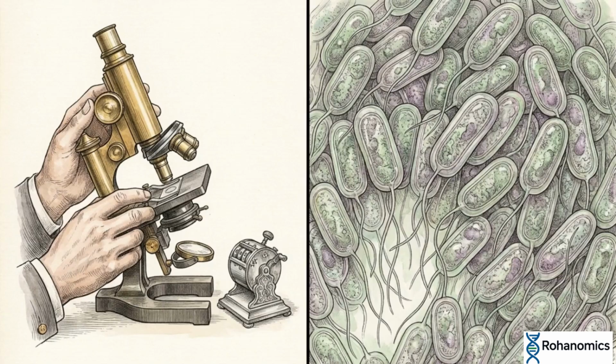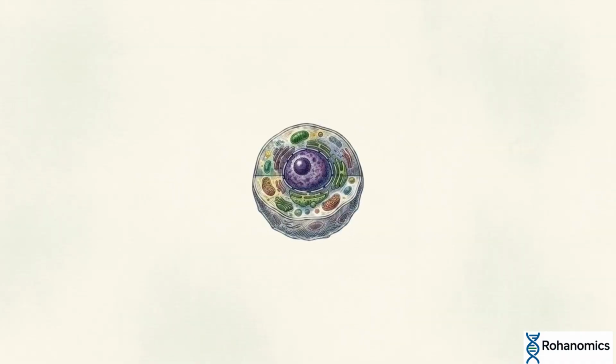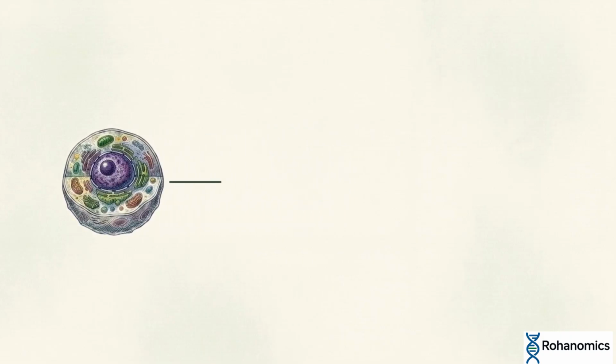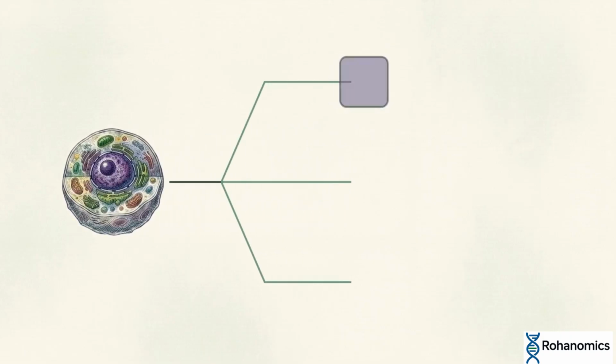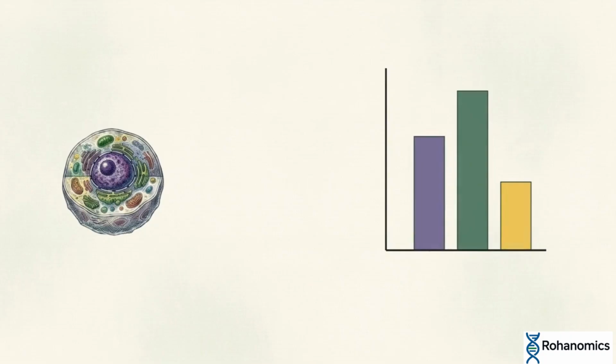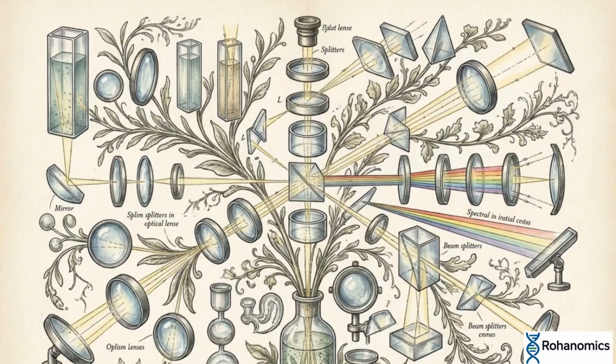Manual observation is limited by the physical speed of the researcher, creating a gap between the biology scale and our measurement. To bridge this gap, researchers engineer biological proxies. We move past looking at the cells and start looking at the signals they produce, converting their physical presence, their metabolic engines, or their chemical footprints into readable data. We are going to map the mechanics of cell quantification.